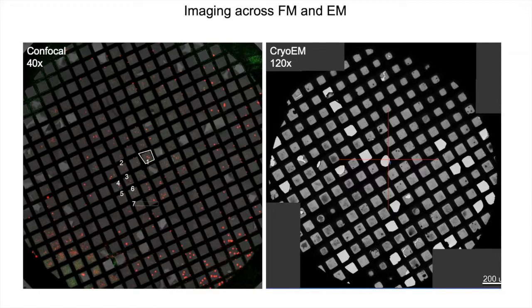Okay. So by eye, we are doing a correlation. We can say there are broken squares here, and then you have to also look at, after this, there's a broken square here, intact square there, broken, intact, and then 2 broken. You can look at that here, right? Broken, intact, 2 broken, right? So you can be almost certain that this is a square that you are interested in collecting your tilt series data set, okay?